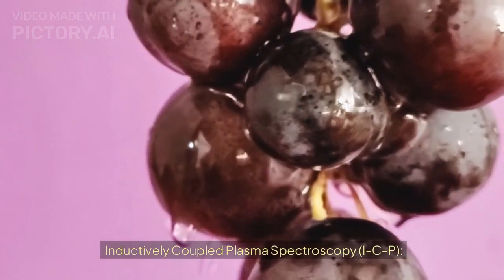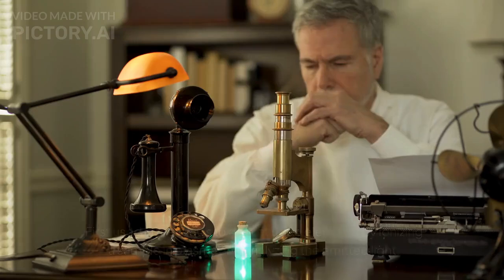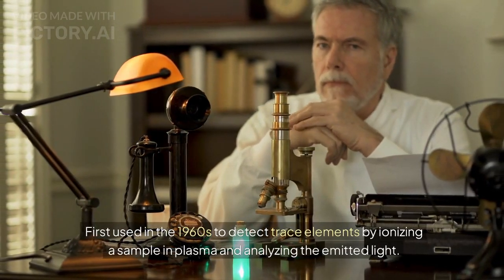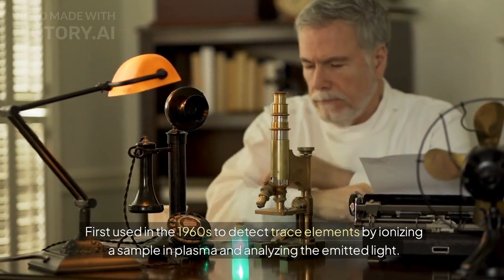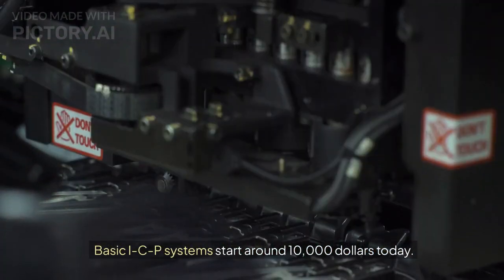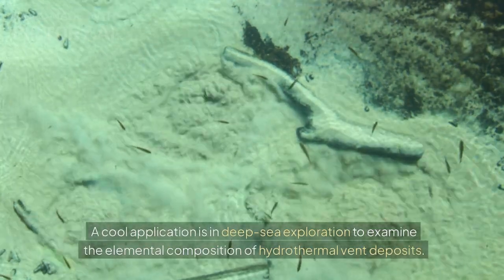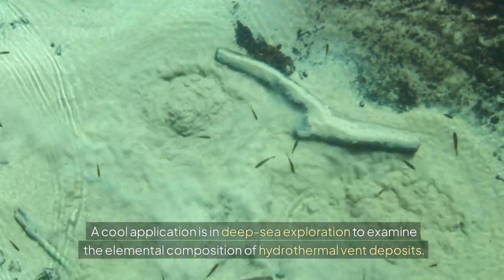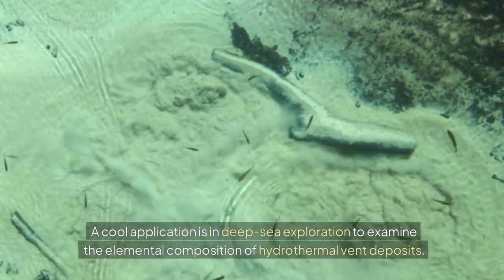Inductively Coupled Plasma Spectroscopy, ICP, first used in the 1960s to detect trace elements by ionizing a sample in plasma and analyzing the emitted light. Basic ICP systems start around $10,000 today. A cool application is in deep-sea exploration to examine the elemental composition of hydrothermal vent deposits.